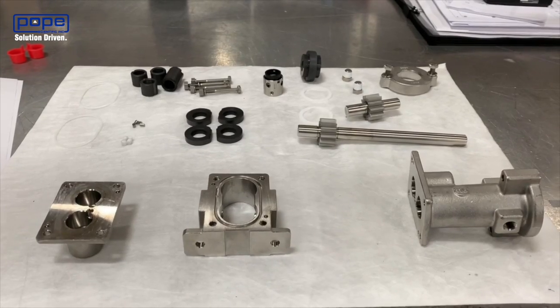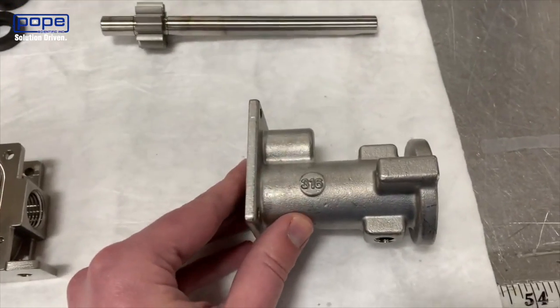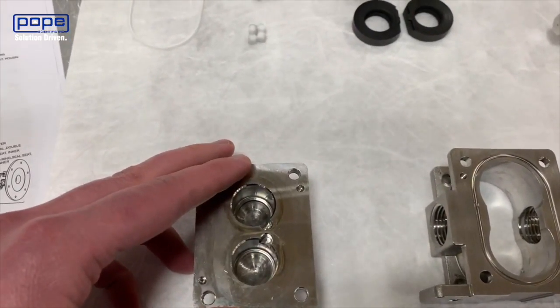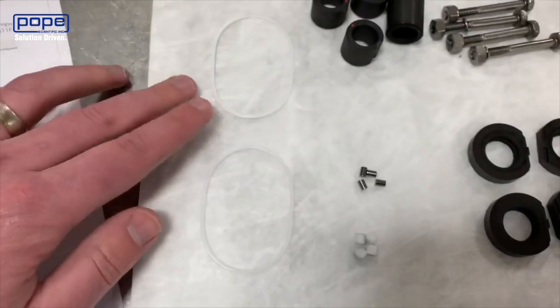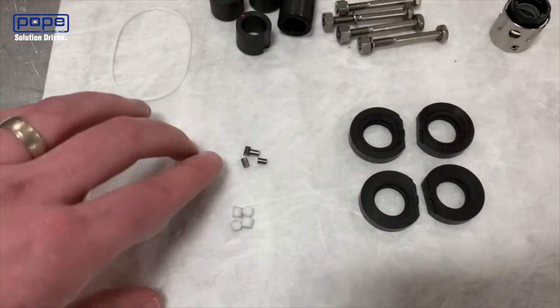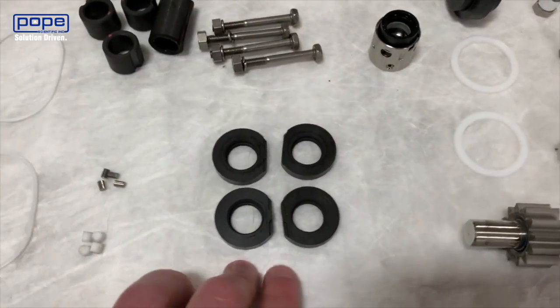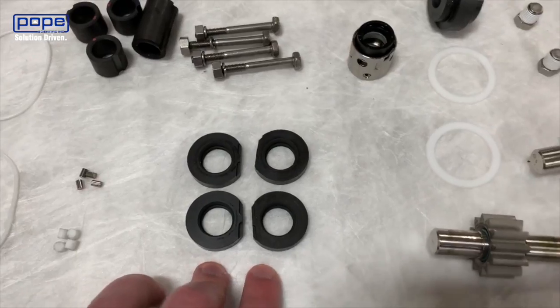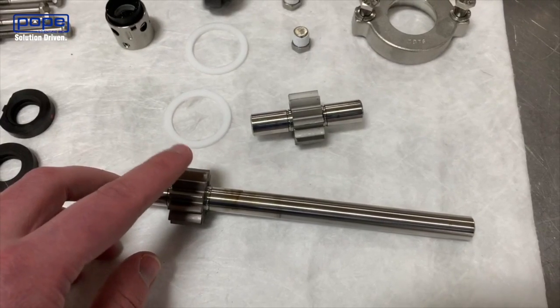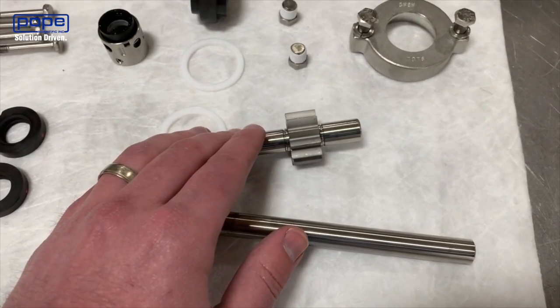Just going to do a quick run through of each of the components that are part of your pump. First we've got the front housing, the center housing, and the rear housing. Within the center housing you're going to have housing O-rings, one on each side. You're going to have a total of eight pins — four stainless steel and four Teflon. You're going to have four carbon wear plates, your drive shaft and drive gear, then your idler shaft and idler gear.